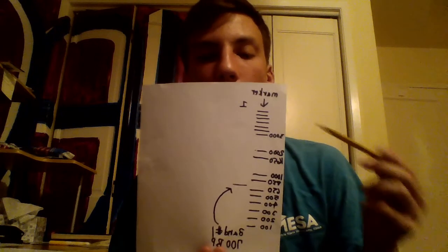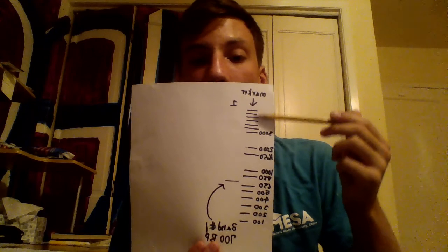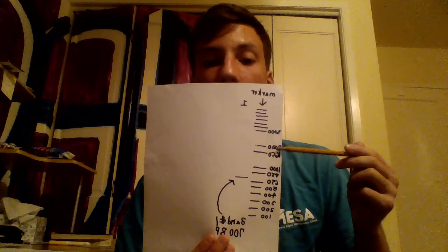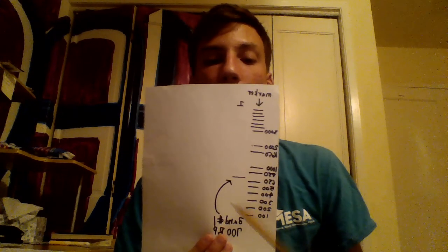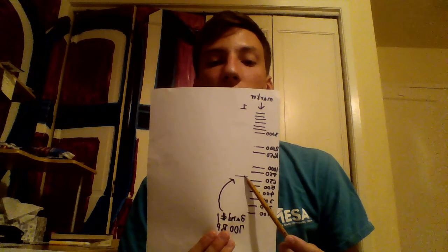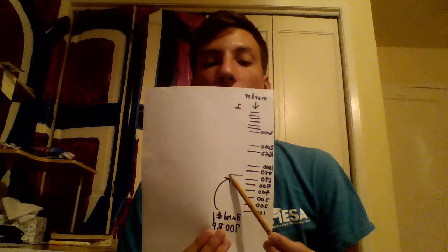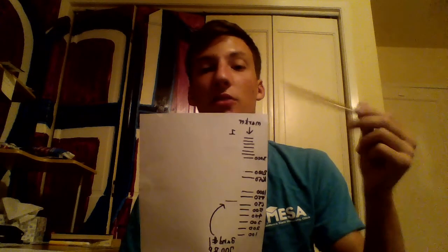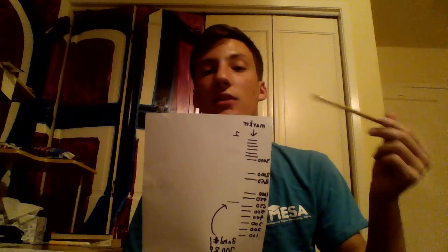When we run our gels, we have to make sure we put in a marker, and that will tell us how many nucleotides are in each place. So let's say if our marker is here, there's 3,000 base pairs, and 2,000 base pairs here if our band was here. Let's say our band from our PCR gel was right here, around the 700 mark. The entire band includes the insert plus the 100 nucleotides from each part of the vector backbone, that's 700. So you minus 200 and you get 500. And that is the amount of nucleotides in the insert.